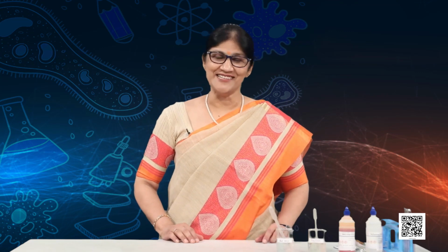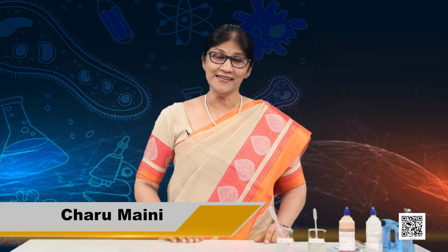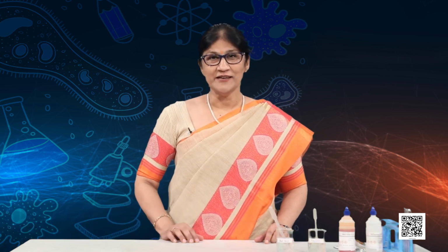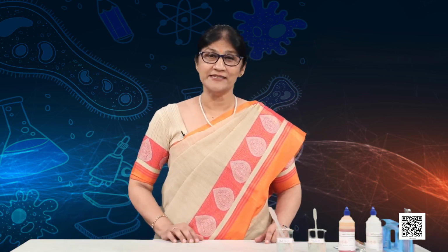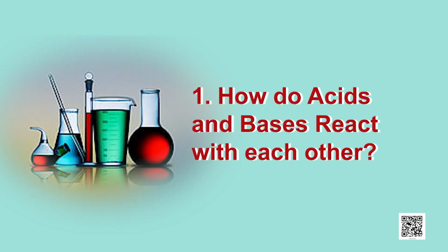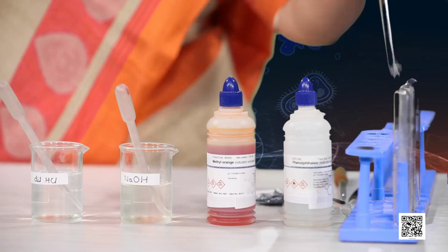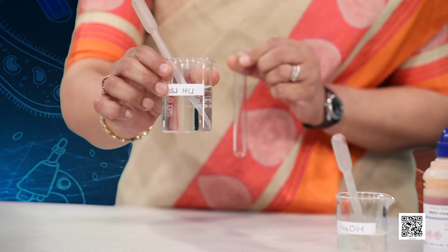Hello my young scientists. So far we have learnt how various indicators may be used to distinguish between acids and bases. So now let's see how acids and bases react with each other. We will use our previous knowledge for this. So let's start. I have some dilute HCl here.